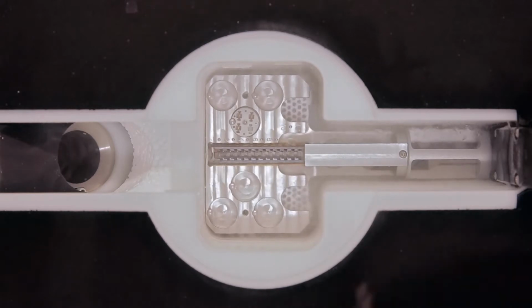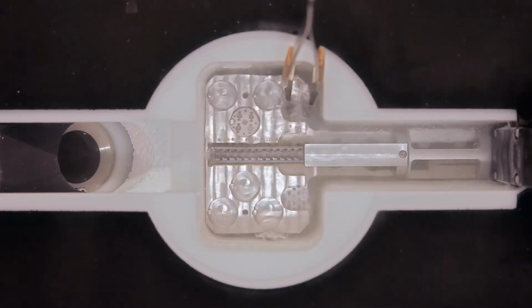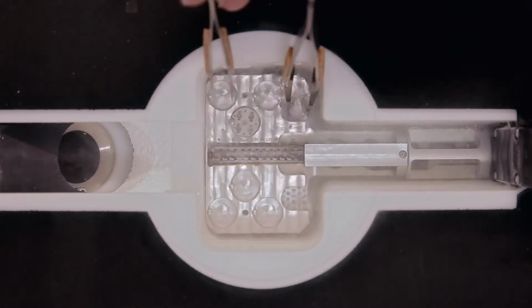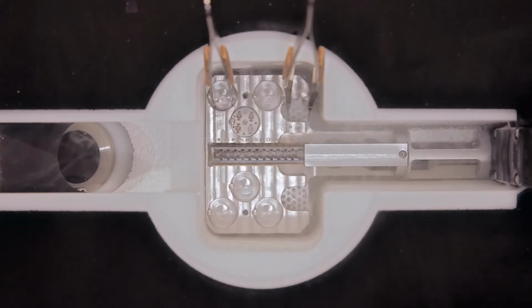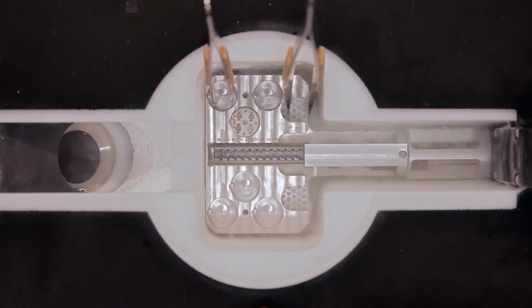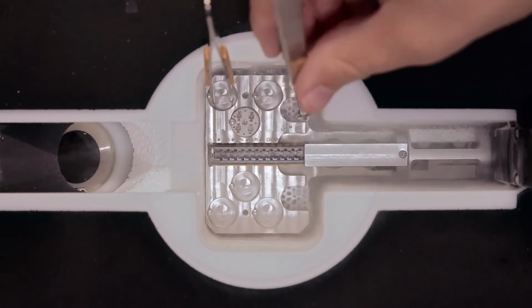The next thing is we take our auto loader tweezers and cool them down. And we might also need a pair of standard tweezers. We can cool them down as well. And again, you want to wait for the Leidenfrost effect. So when the hissing sound is over and the boiling stops, the tweezers are cold enough so you can grab the grids.